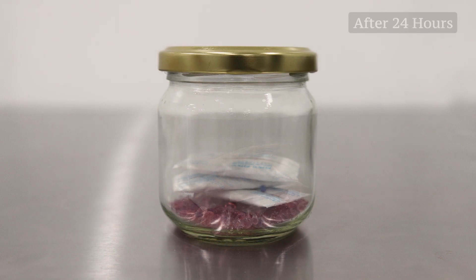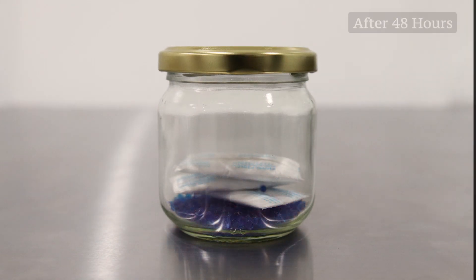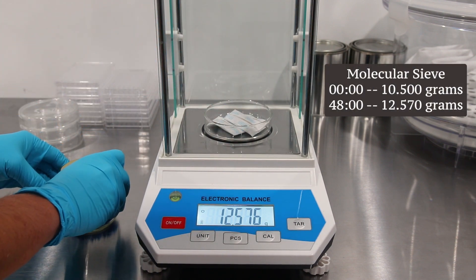After 24 hours the pink silica gel begins reverting to its original color. After 48 hours the silica gel turns blue once again. At this stage it is time to weigh each desiccant individually for further analysis.